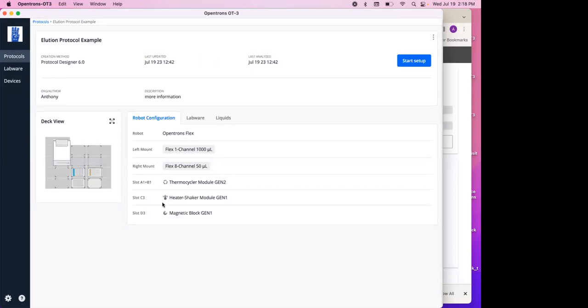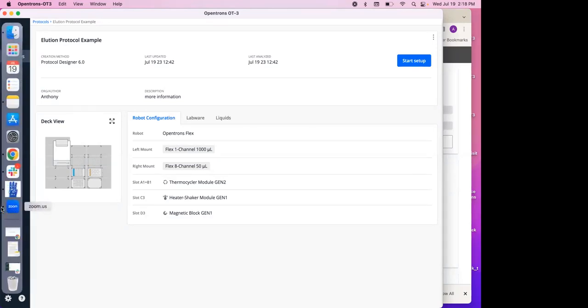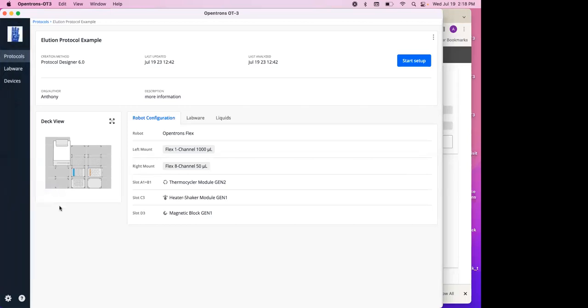We do have a couple of questions. One I'm going to save to the end, but one from Path I'm going to ask now because it's related to what you just showed, Anthony. Is there a way to pause and provide user input with a button selection or text box? I presume that's halfway through the protocol run, but Path, if you have any additional information, keep typing.